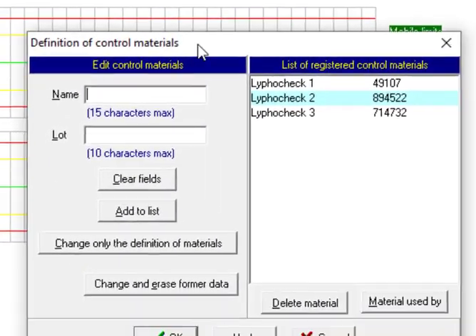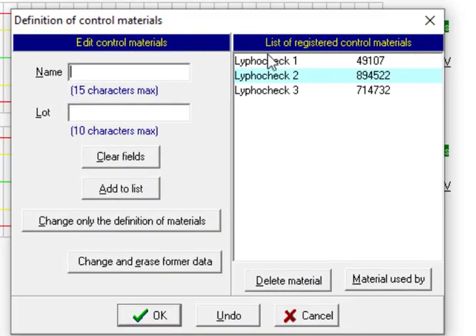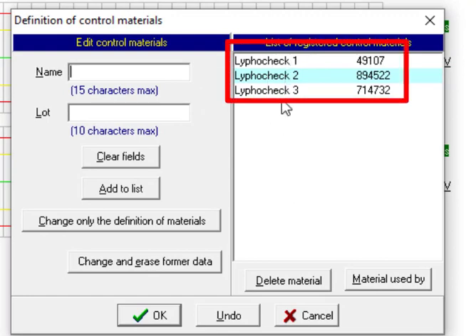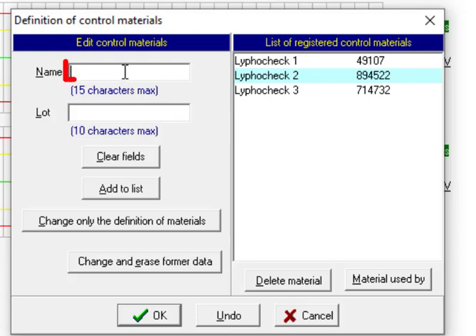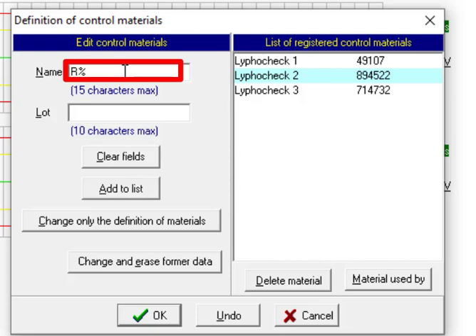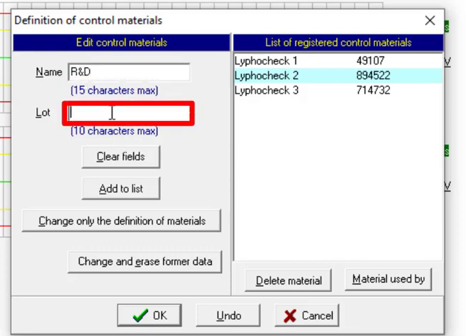The name of material is for example R&D and the lot number for example is 11233. It's just a test and for educational purposes and we do not have a real lot here.